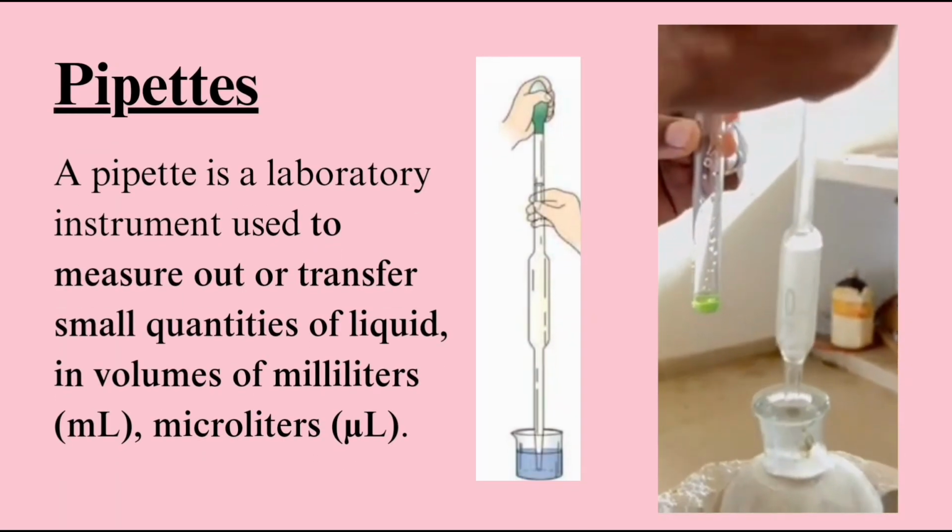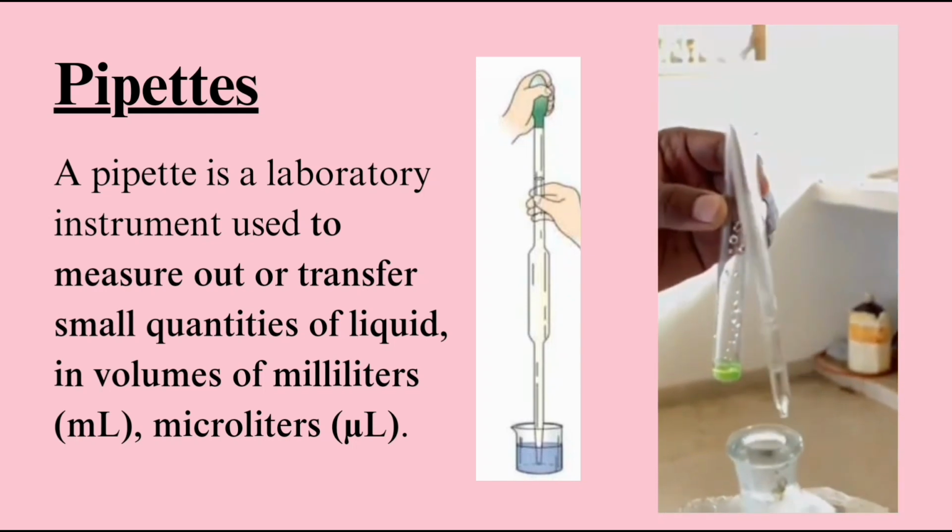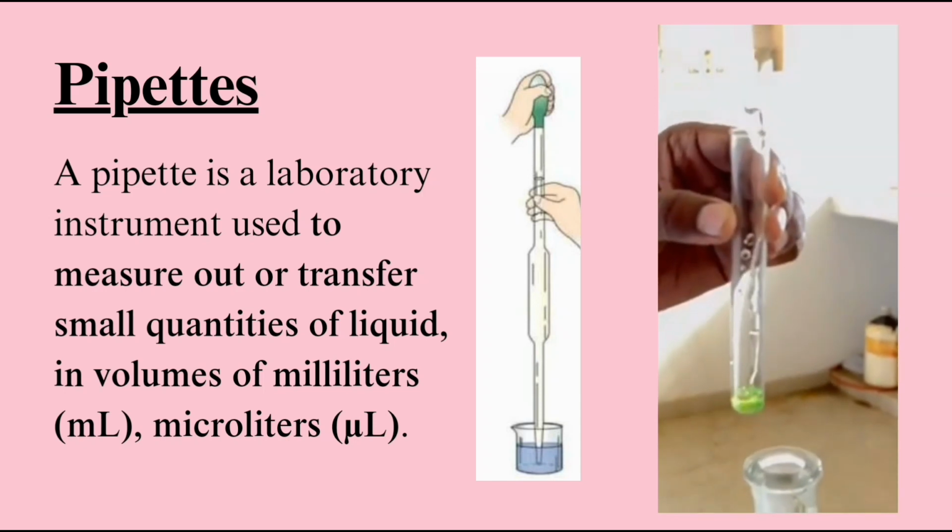Pipette. A pipette is a laboratory instrument used to measure out or transfer small quantities of liquid, in volumes of milliliters (ml) or microliters (μl).